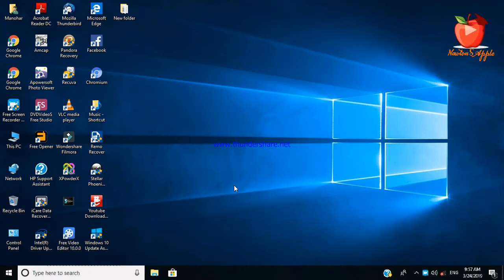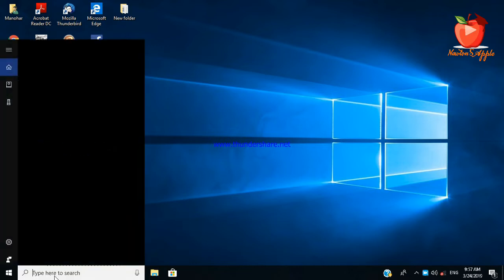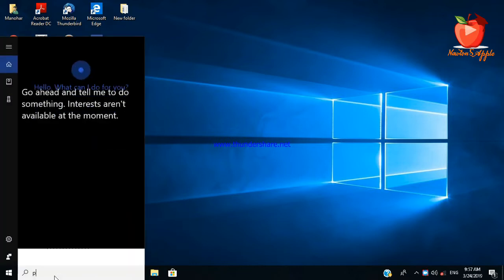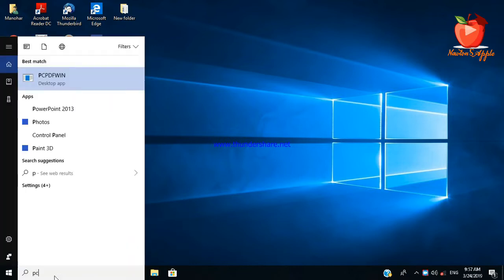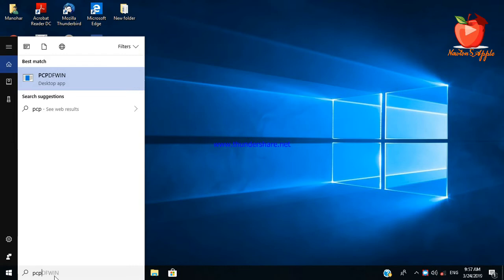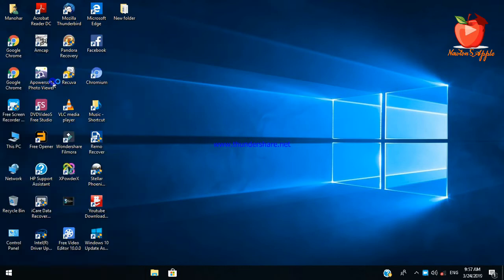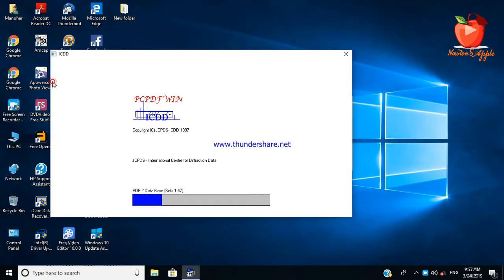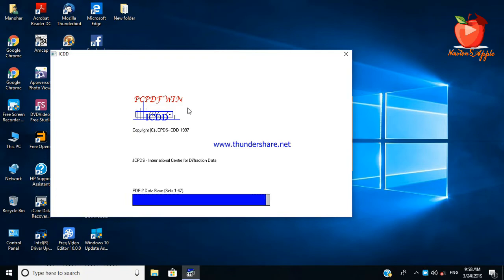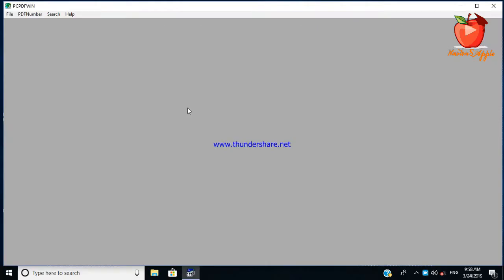Hello friend, today we will see how to use PC PDF Win software for the analysis of XRD data. I will open PC PDF Win software, so now it is loading. This software is used for indexing the XRD data.